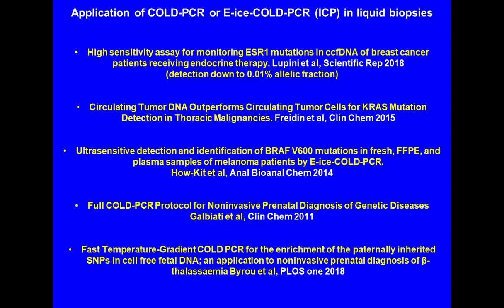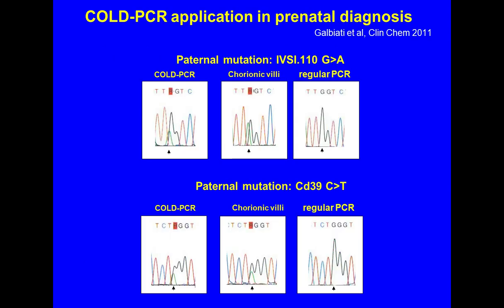Now, for prenatal diagnosis in particular, what one is interested in is to detect the paternally inherited mutations in maternal blood. That's what the technology is good for, because these are going to be low-level mutations, and you need to enrich them and detect them with confidence.